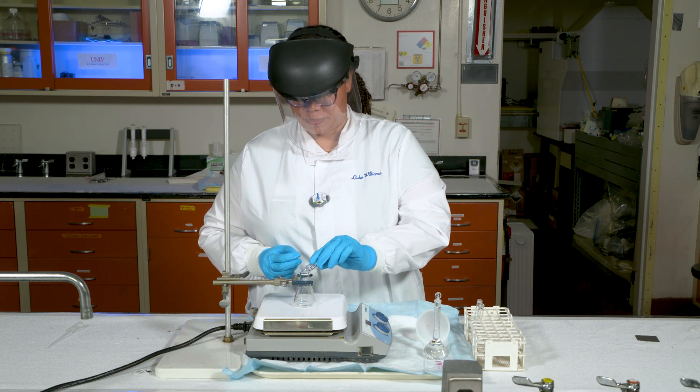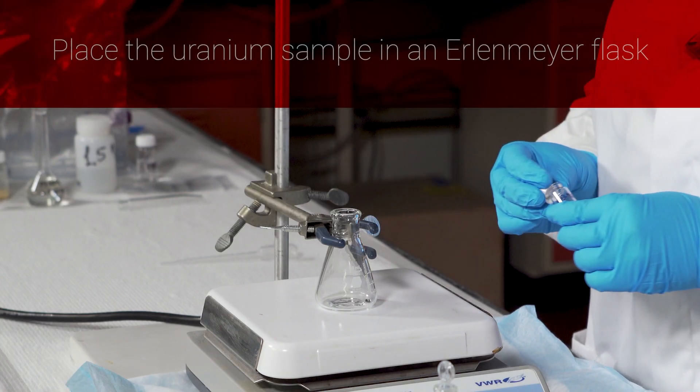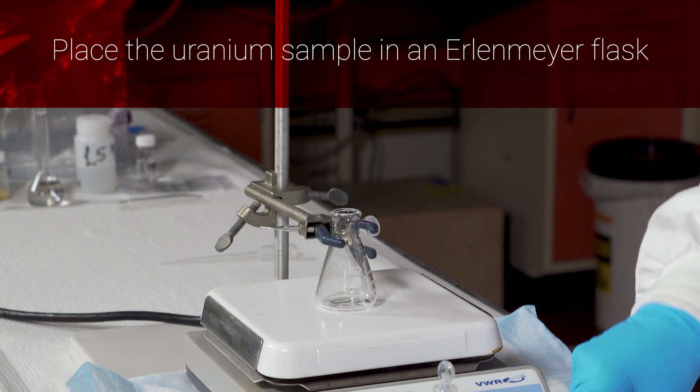To start, we place the uranium sample in an Erlenmeyer flask and add about 30 milliliters of 6.5 molar hydrochloric acid to dissolve.